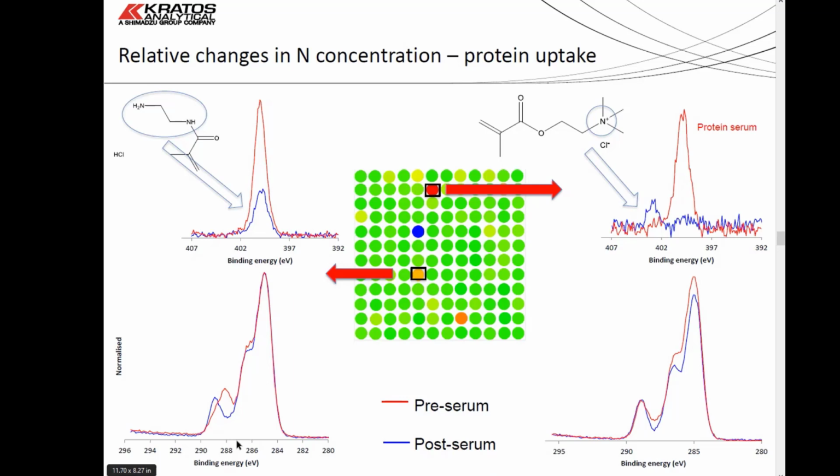You're looking at 144 samples, so time becomes a big thing when setting up the initial acquisition. When you press go, you don't want over scanning or under scanning for a particular element. So that kind of experimental optimization is a bit of a thing, but you can quickly see in the simple color scale which ones have been important and which one hasn't.